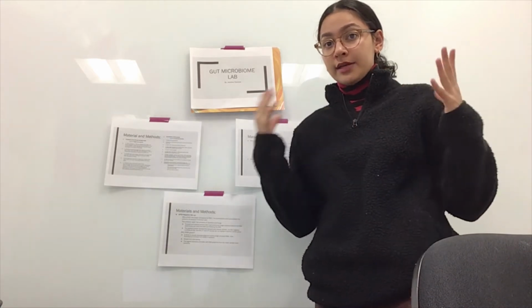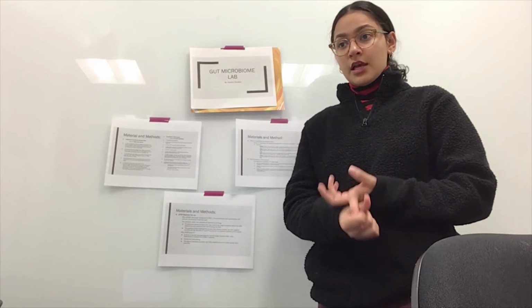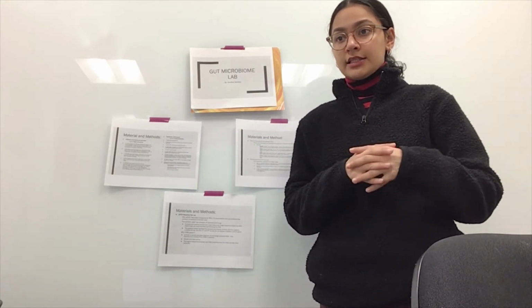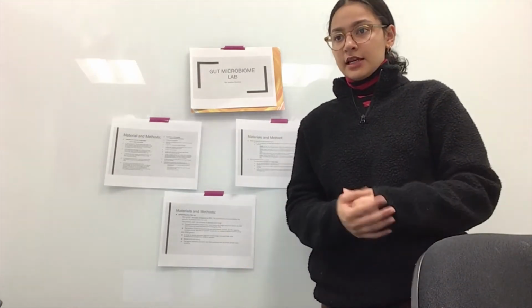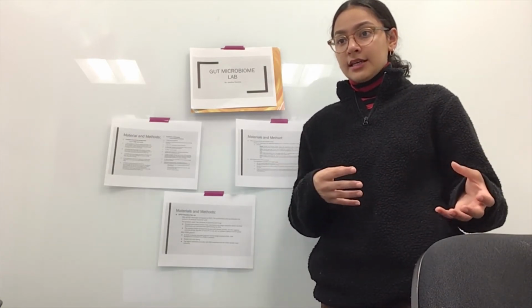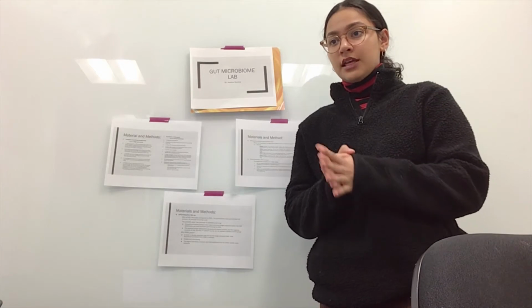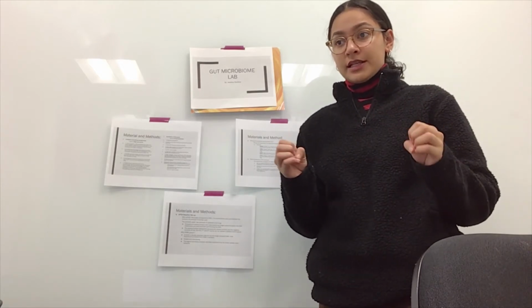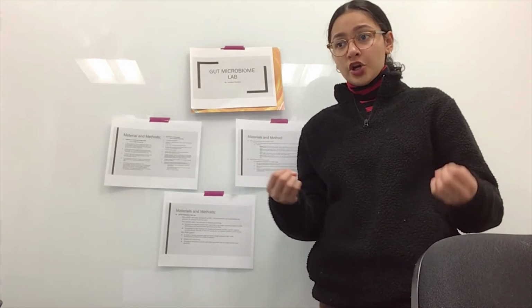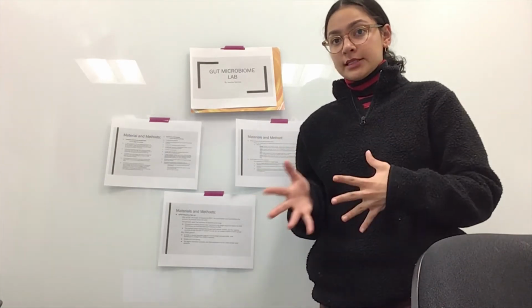The way we did this was in a series of three steps. We first isolated the DNA from the fecal samples using a commercially available kit called Qiagen, which is specifically designed for the isolation of DNA from stool. Second, we quantified the DNA using a UV absorbance spectrophotometer and then normalized the DNA samples by doing dilutions. Lastly, we used qPCR to quantitatively amplify a very specific region of the bacterial genome called 16S rRNA, using a group of specific primers so that we can determine the relative proportions of the various groups of microorganisms present.